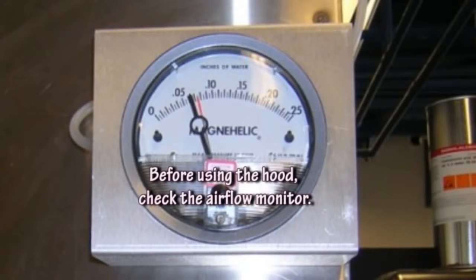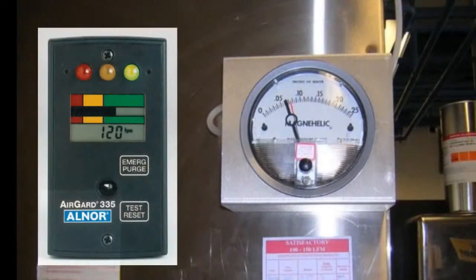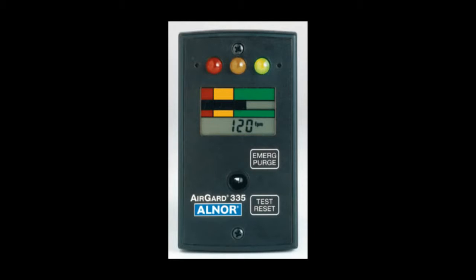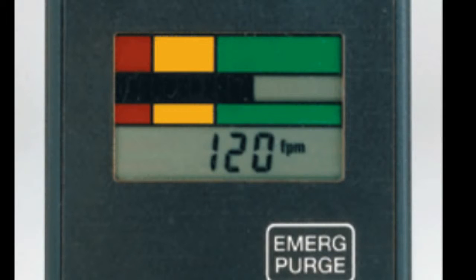One should always check the quantitative airflow monitor or alarm to verify that airflow for the fume hood is proper. There are two types of airflow monitors used on campus fume hoods: digital monitors and differential pressure gauges. Digital monitors display air velocity into the hood and should read more than 100 feet per minute.